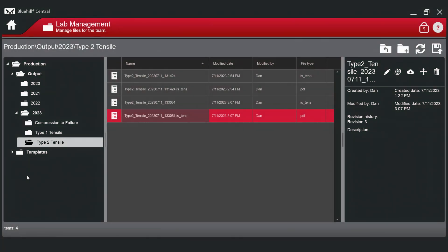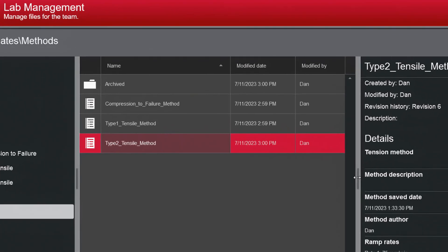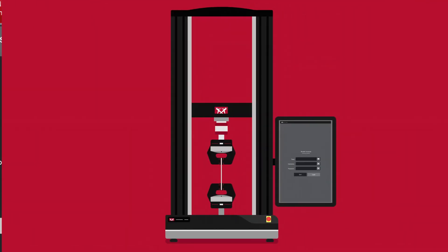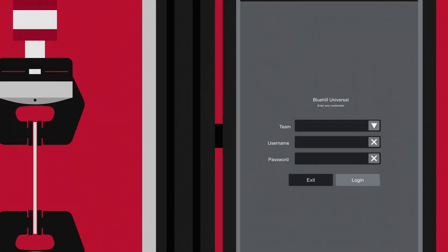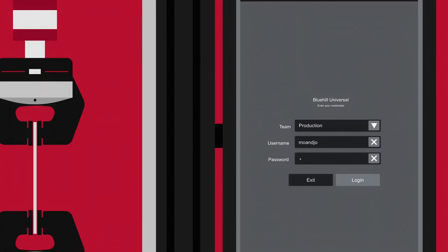In this case, we are showing the output and templates folder of a production team. We only see the files for the production team because a member of the production team logged in.